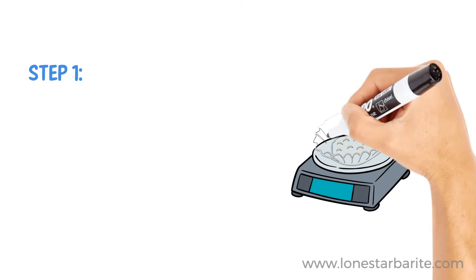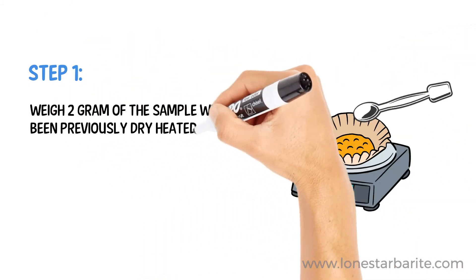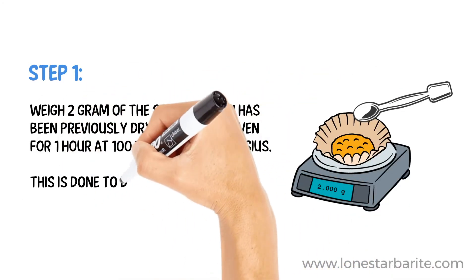Step 1. Weigh 2 g of the sample which has been previously dry heated in an oven for 1 hour at 100 to 110 degrees Celsius. This is done to dry the sample.